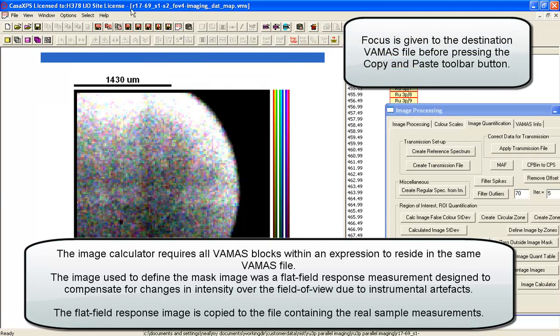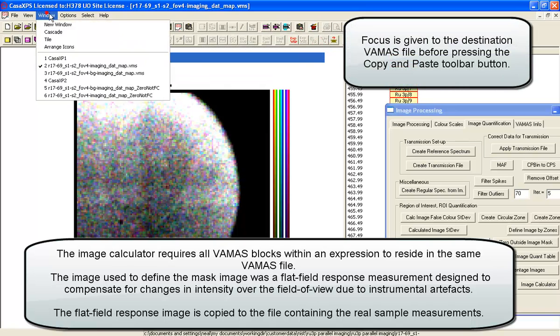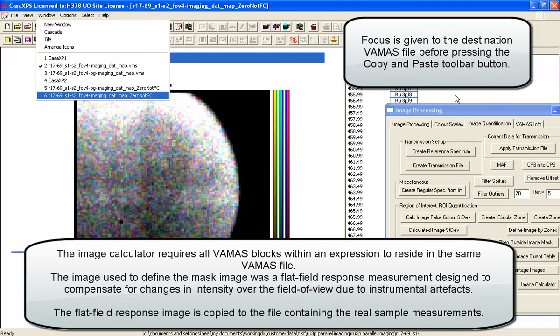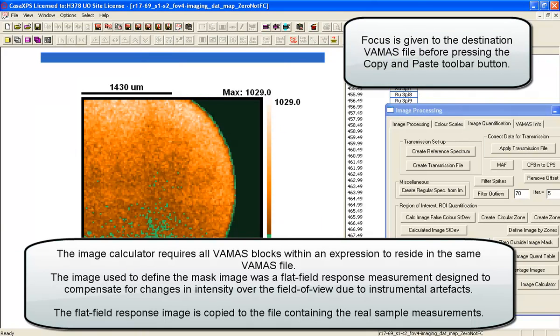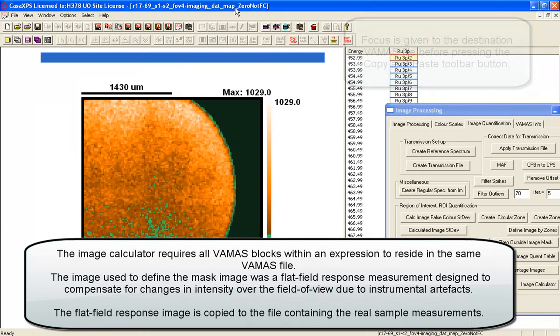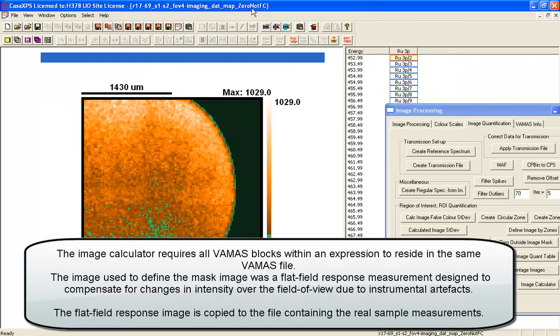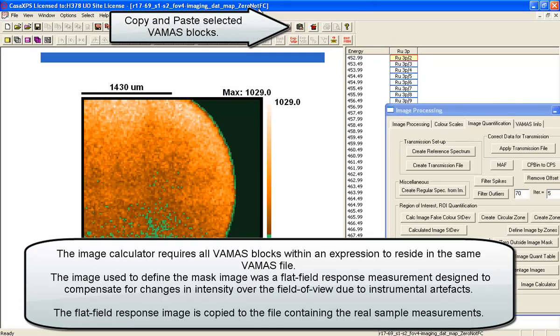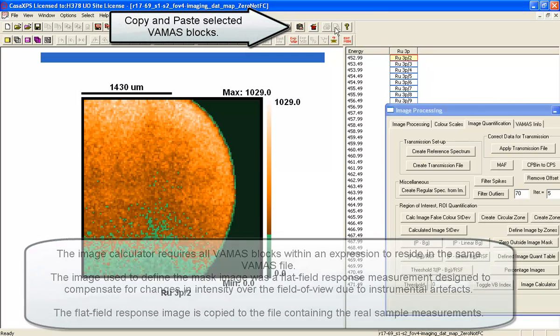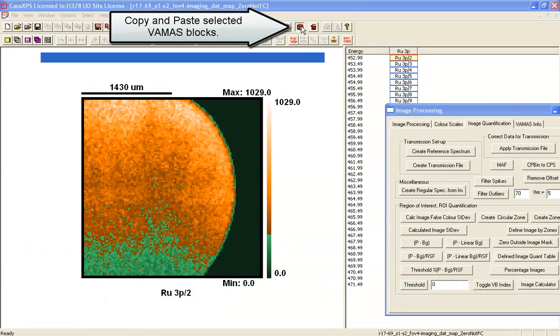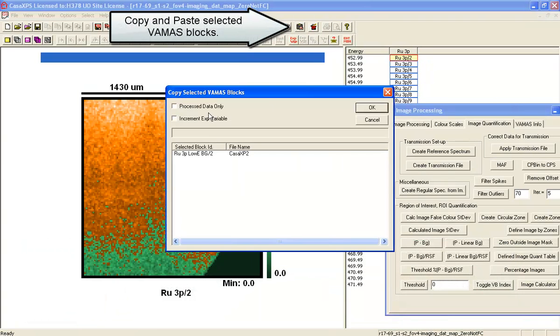So if I now take the image that the mask was defined on and copy that into this newly created set of images, and here we have underscore zero, not FC, that's not false color. I can copy that VAMAS block into here.